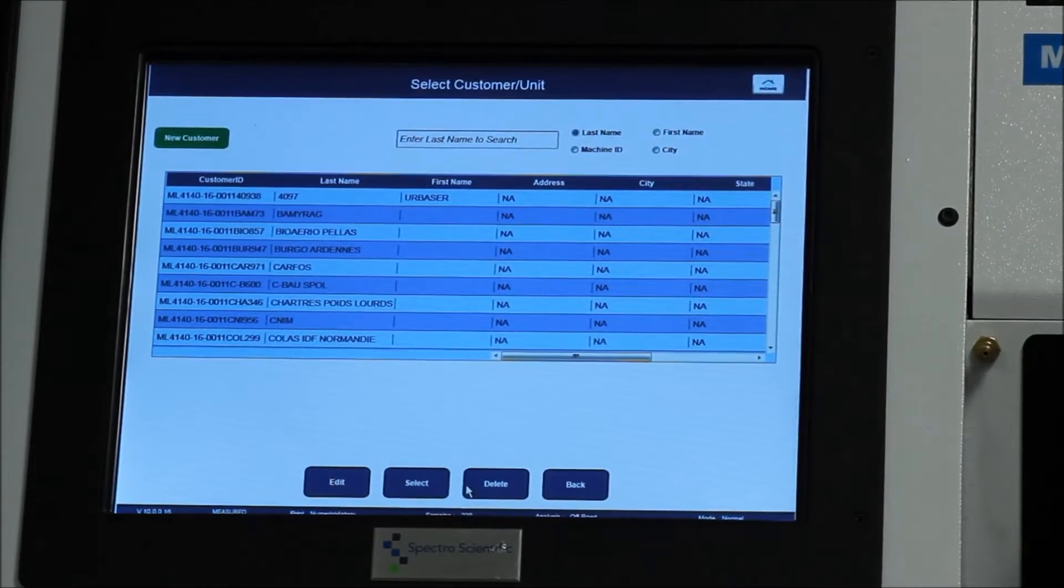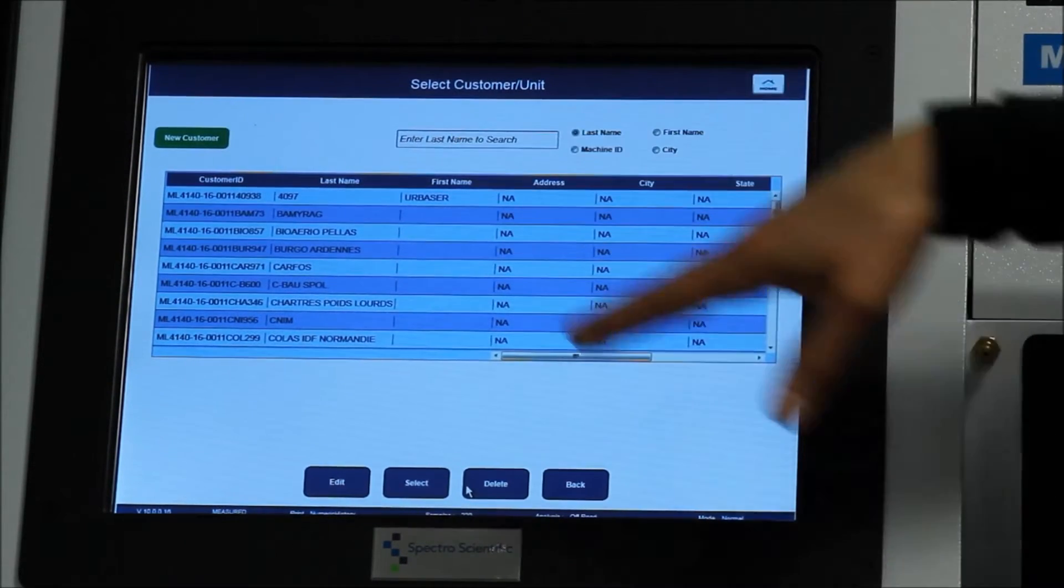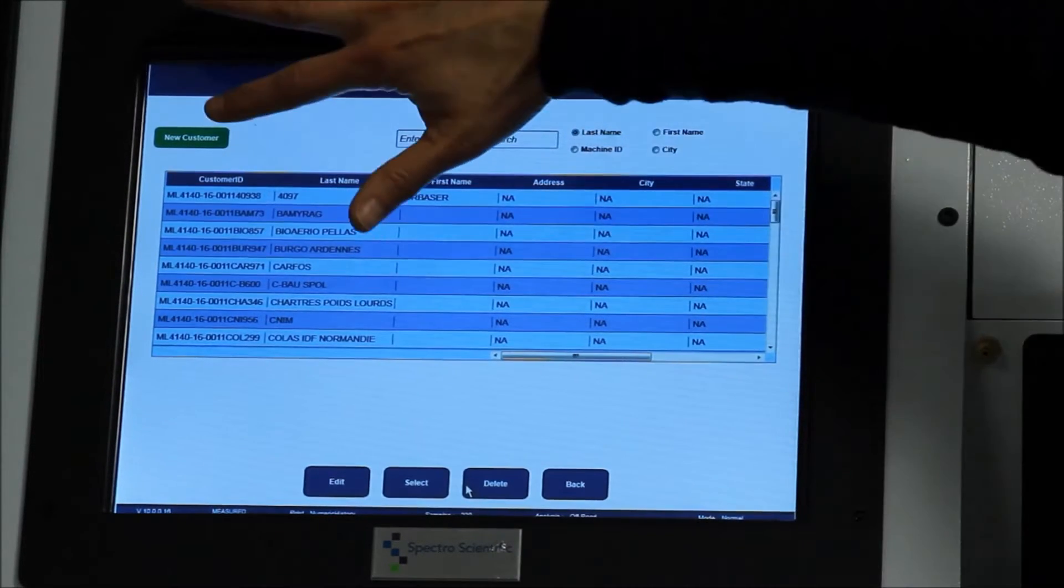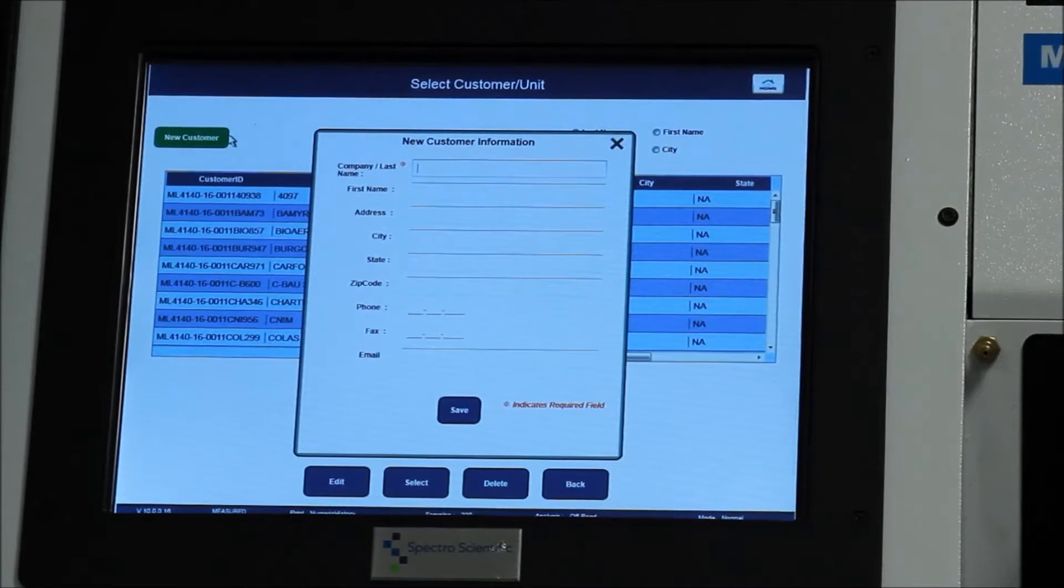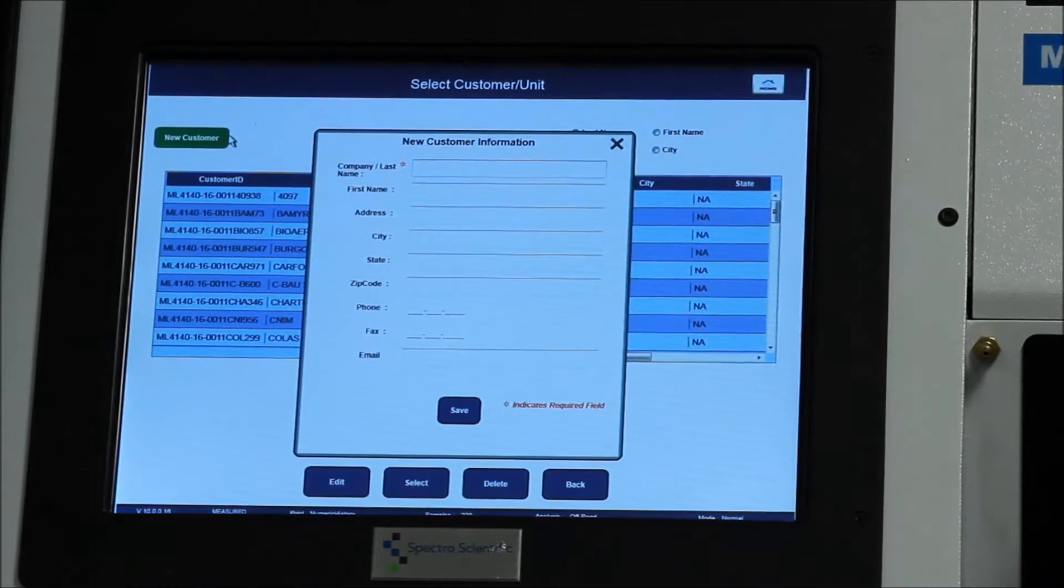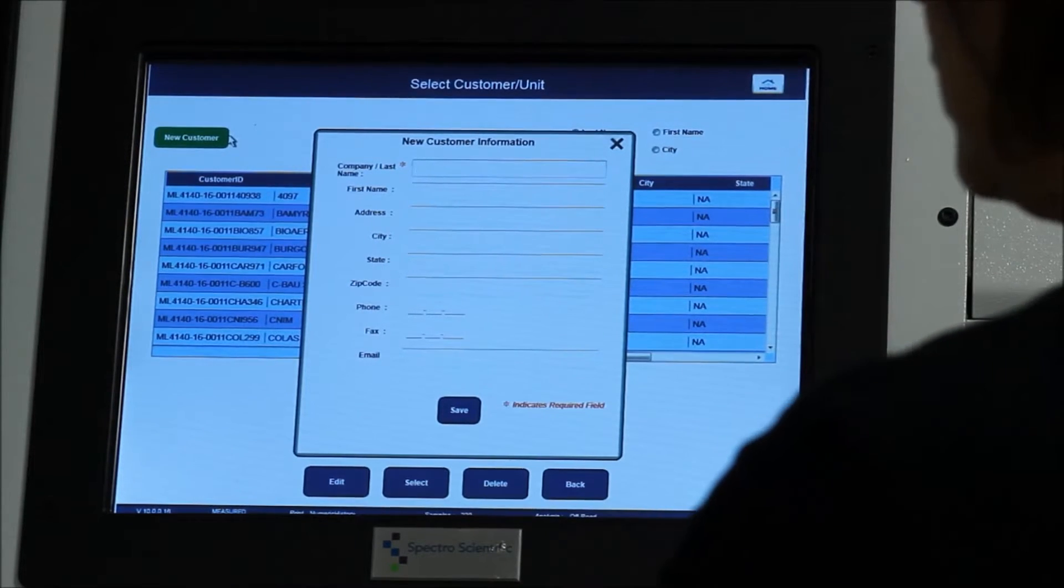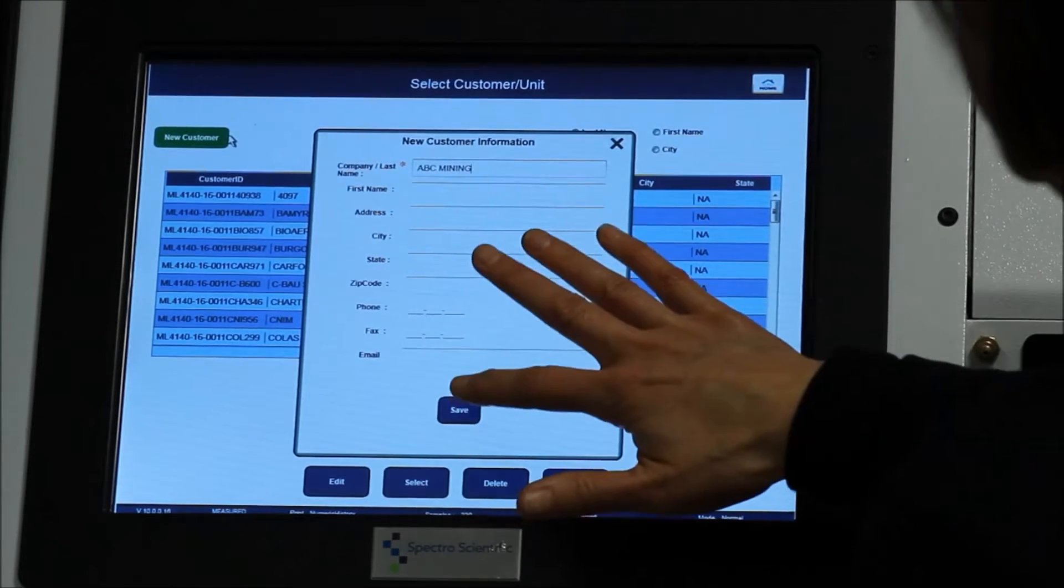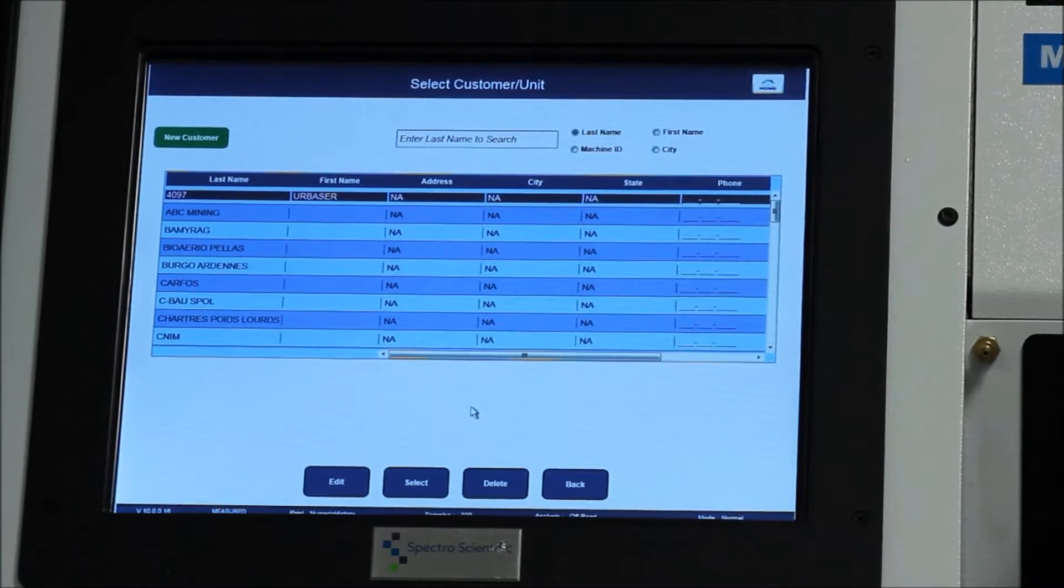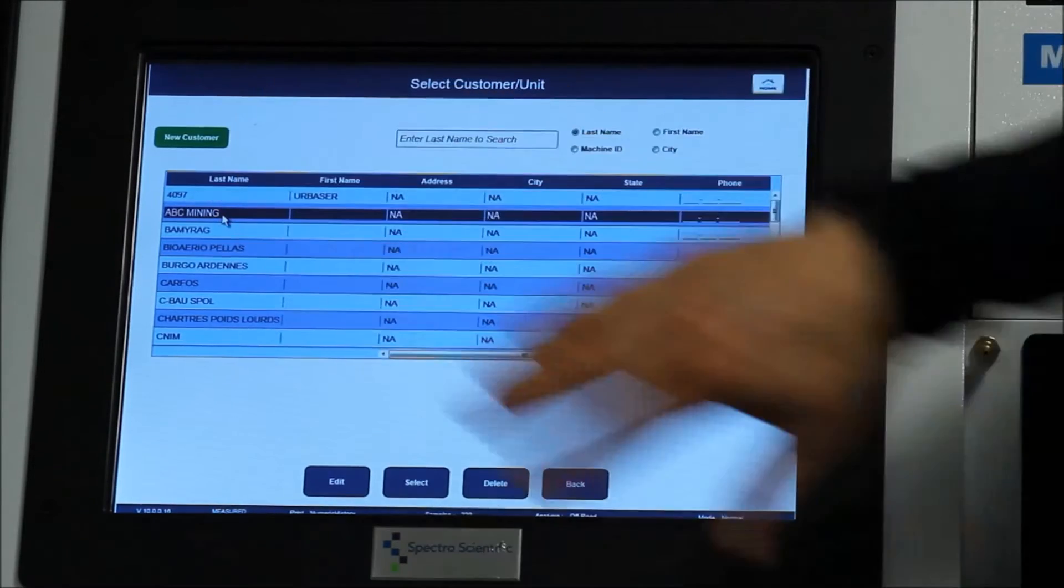Next we're going to choose a customer. The ones that have already been run are set up and you can choose it if it's there or you can set up a new customer. A customer can be either a company or it can be maybe a division or department within a company. In a mining company, it might be the haulers or the diggers. Here, we're going to call this new customer ABC Mining. You can fill out all the information that you want in terms of the address or you can just list the name. And so now we're going to select that customer.